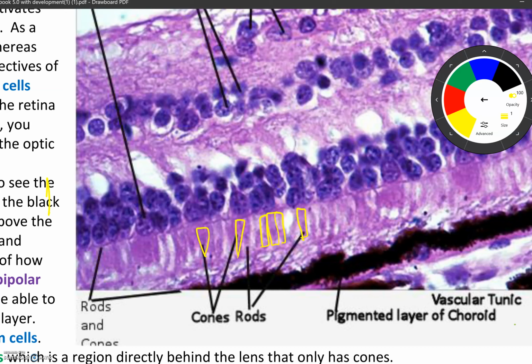Now over here, I have my bipolar cells. Because this is mostly rods here, I have a thinner bipolar cell layer. Again, they're all on top of each other still. So there's probably half as many cells here. Then our third layer, since it's converging, and this is only rods, is our ganglia cell layer. So let's draw that next.